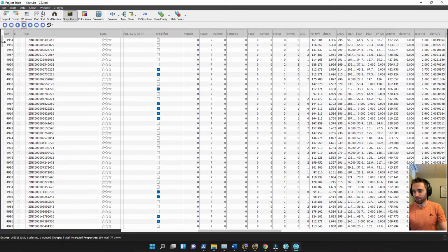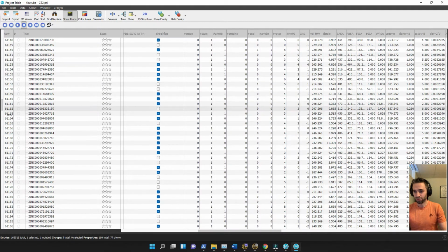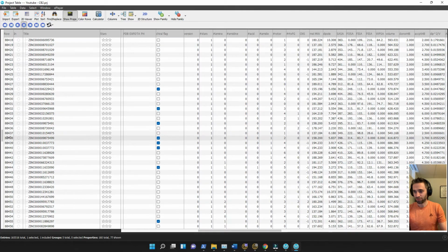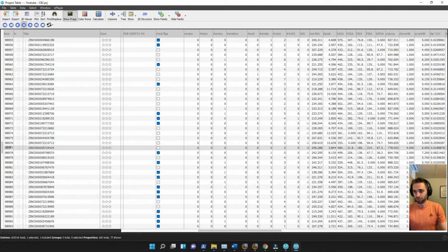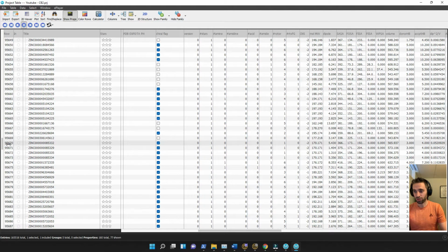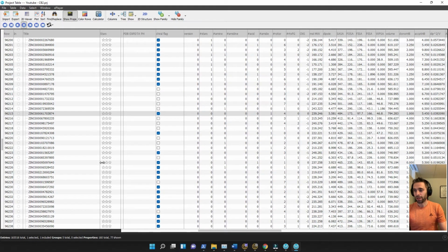What we do is scroll down until we get to 0. Kind of find where it hits 0, 1. Somewhere around here. As you can see, we screen molecules out very quickly with this method. This is 96,000 molecules that will be deleted and gone.